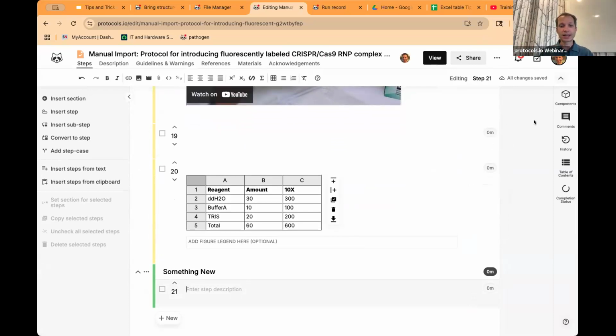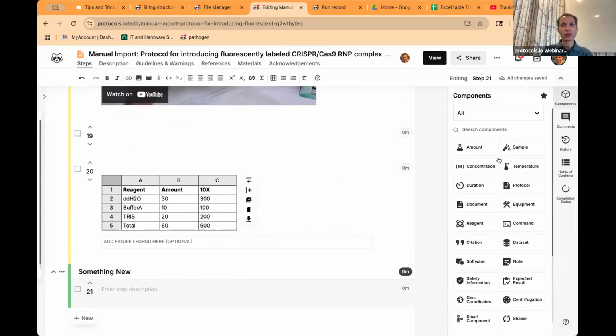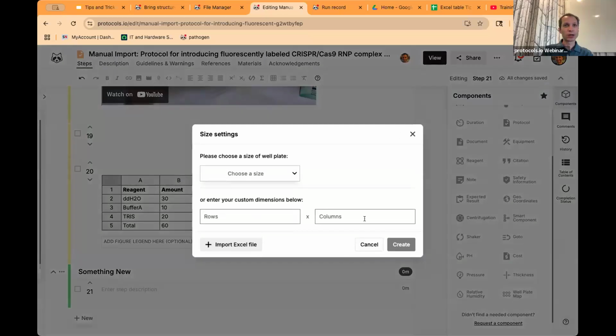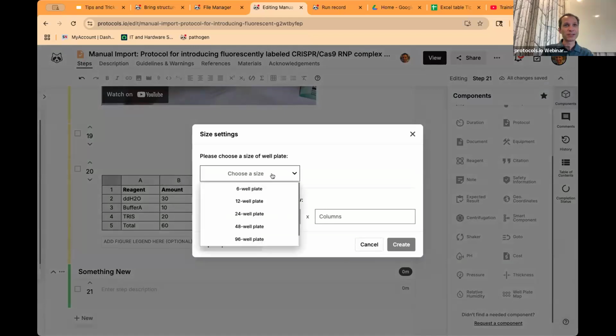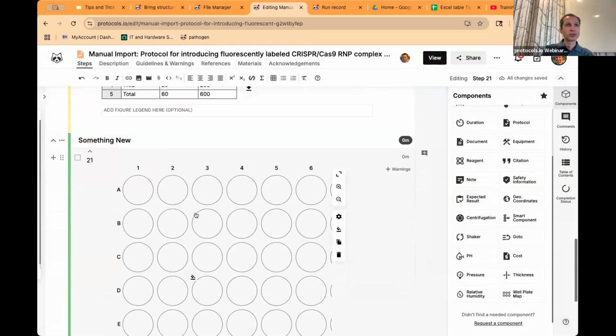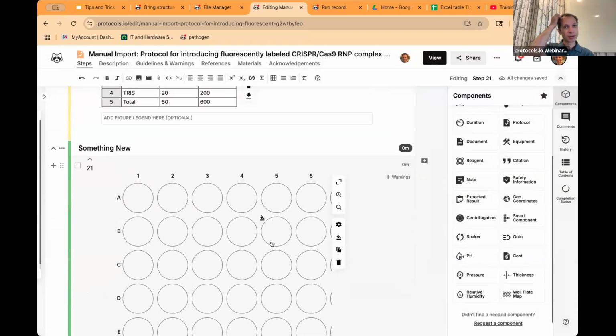And then from components, we did take a look at the smart component. In the biology ones, you will also notice that there is a plate component that's lower down. So if you have a 96 well plate or whatever custom plate you have, we have some preset ones. This allows you to label, color, and has a lot of features.